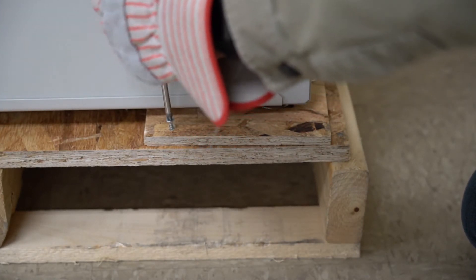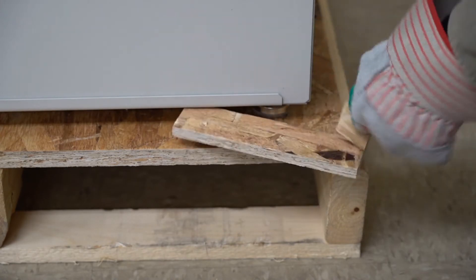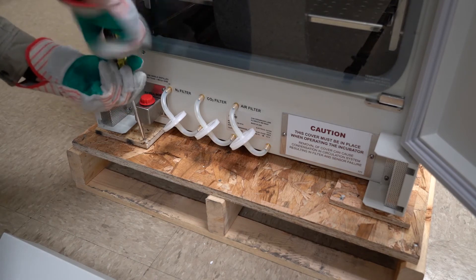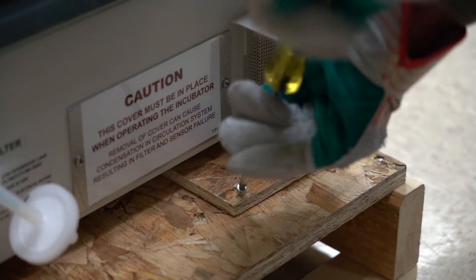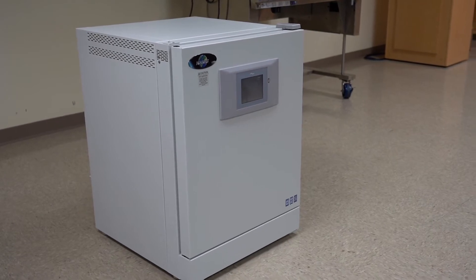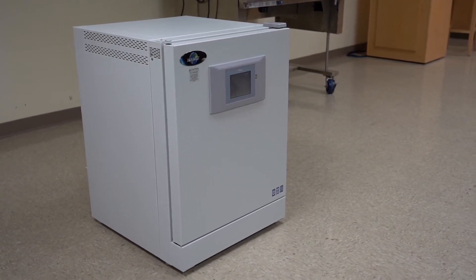Remove the L-shaped brackets from around the incubator leg levelers before moving it off the pallet. Two people should move the incubator from the pallet to the floor one corner at a time. Leave space behind the incubator to connect power and gas later.